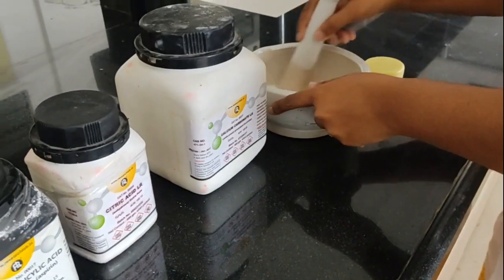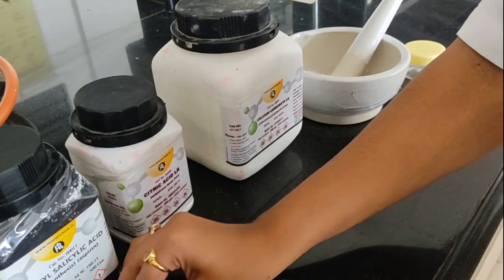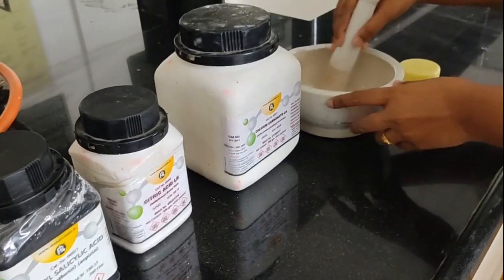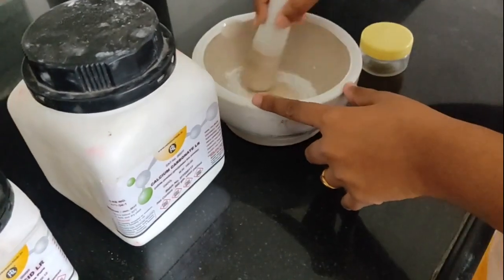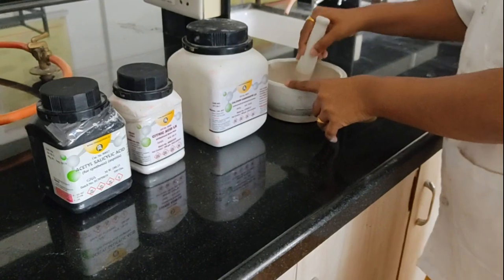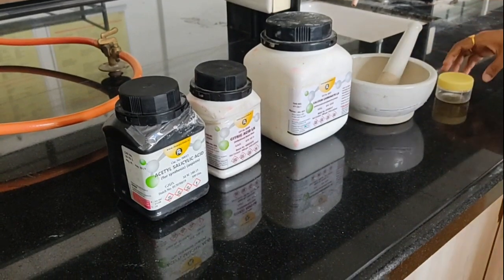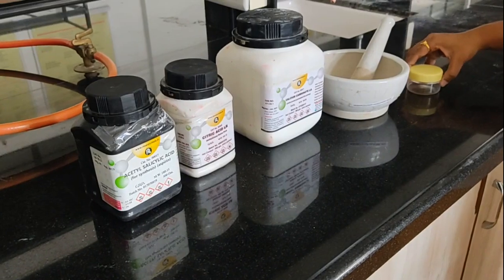After proper mixing in the mortar and pestle, now I am going to add this aspirin, that is acetyl salicylic acid, and incorporate it into the previously added two powders. And after proper mixing, I am going to transfer this powder formulation into this container, and then we will proceed to the next labeling part.